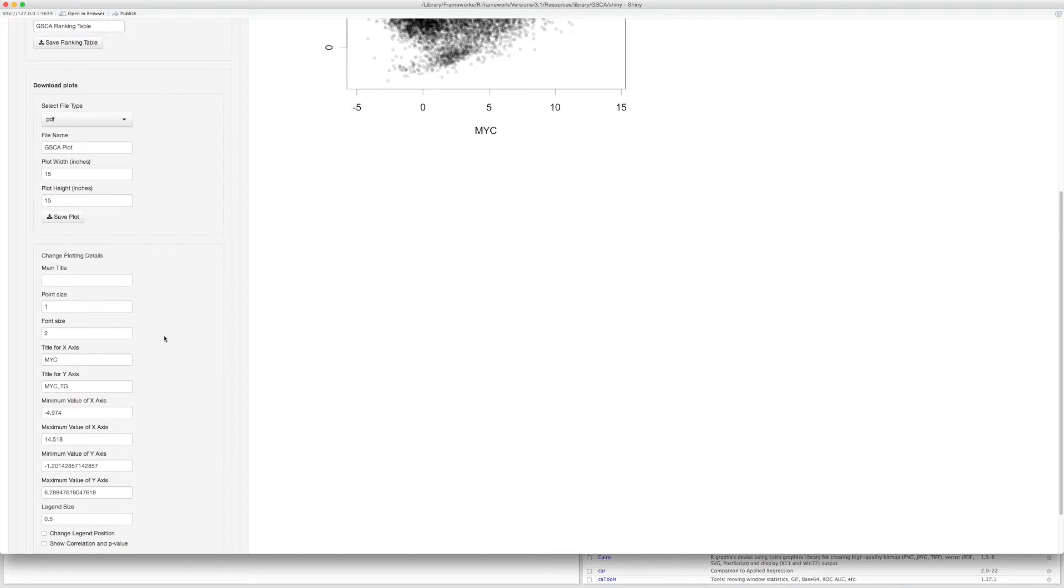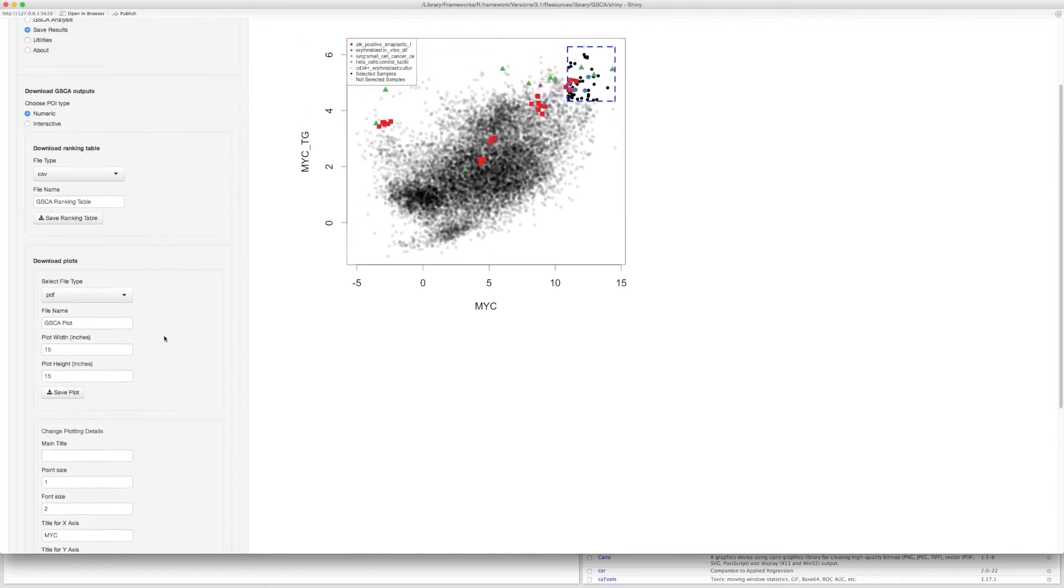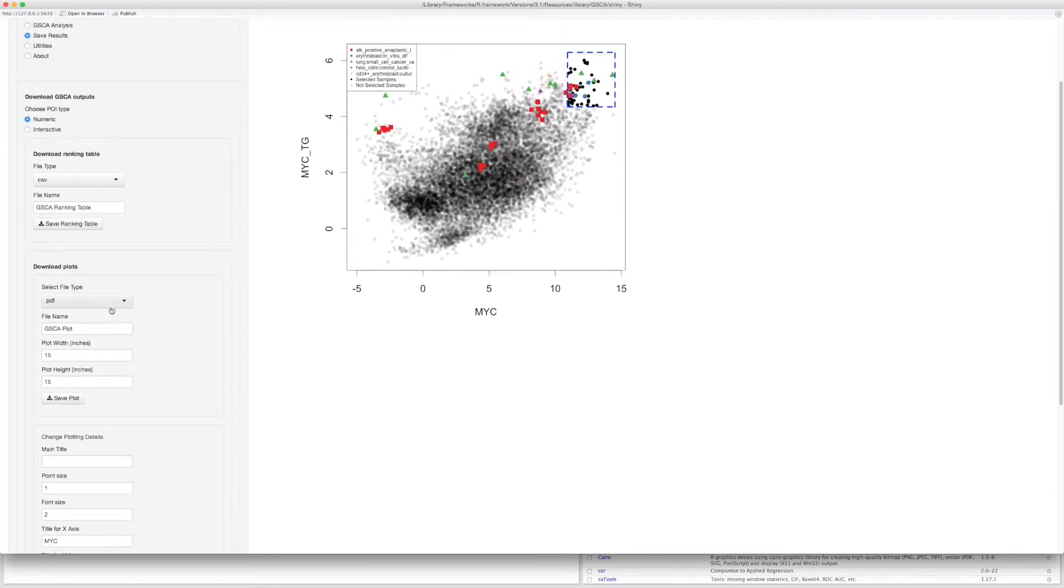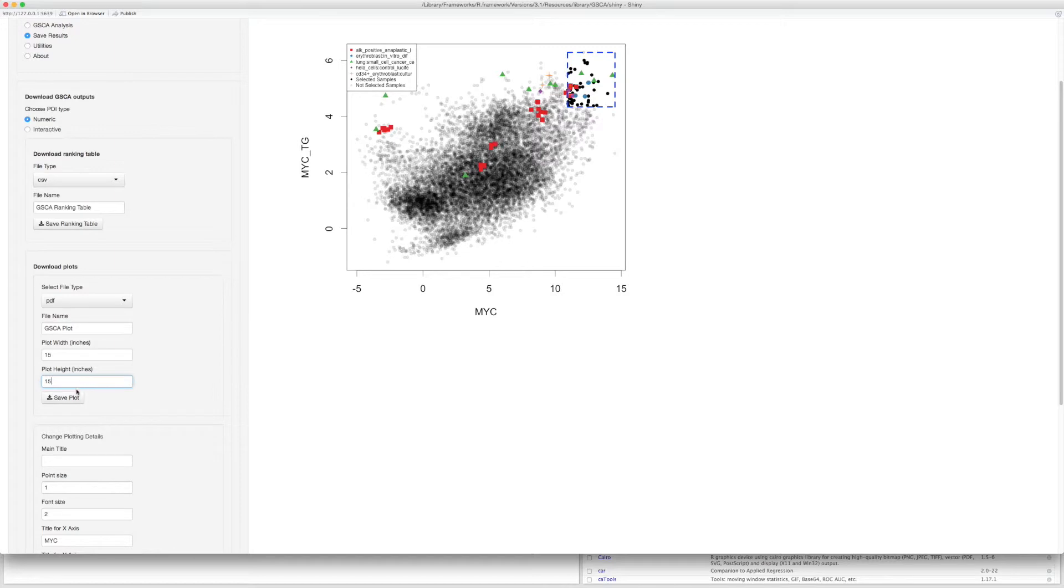For example, you can change the main title, change the size of the legend, and change the range of X and Y axis. You can save the plot in different file types. And you can also specify the width and height of the plot. Click Save Plot to save the plot.